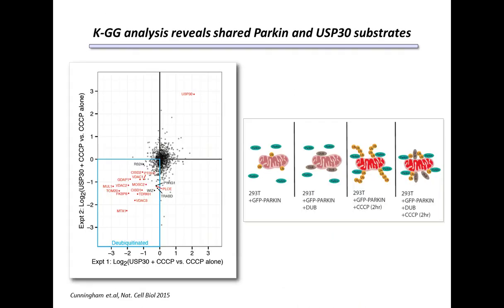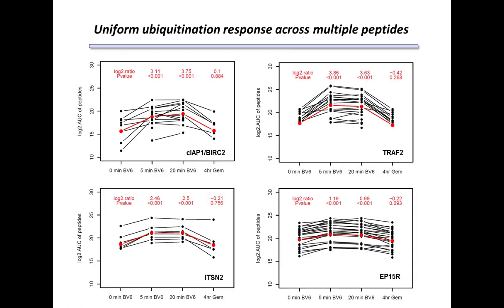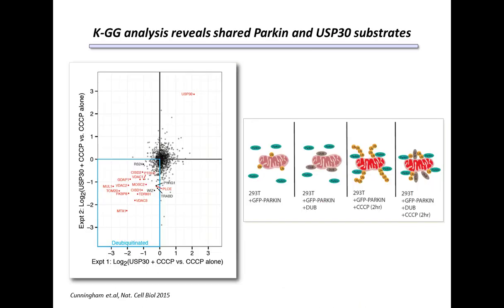Now, when we look at the individual peptides from each of these proteins, there was another interesting observation, and that is that many different sites were being ubiquitinated.